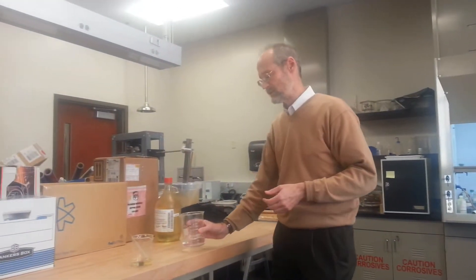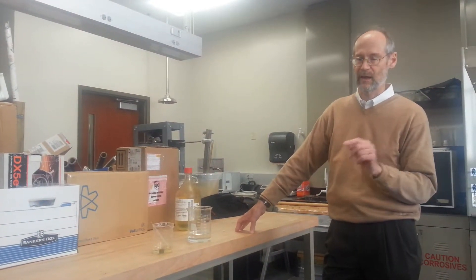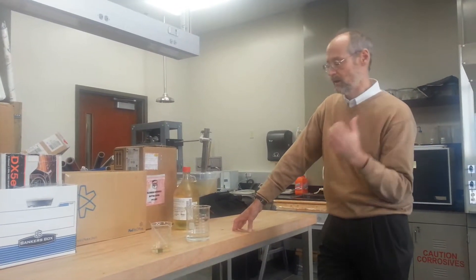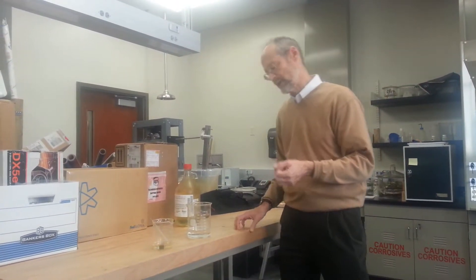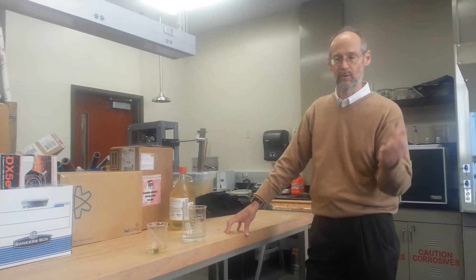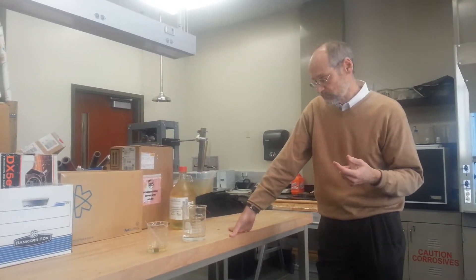So in Part B of this demonstration, I'm going to do something they teach you to never do in chemistry lab, and that's to add water to an acid — you're supposed to add acid to water. The reason for that is because the enthalpy of mixing is significant when you add acid to water, and it's possible to get splattering and things like that.